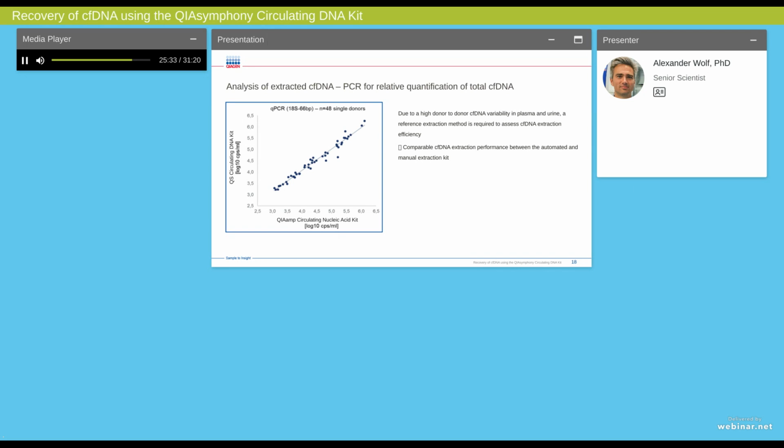In the last years, several providers of internal controls for cell-free DNA offer solutions to control the complete workflow, starting from the DNA extraction process via the downstream assay until the final data analysis. Despite the clear advantage of running an independent control for each sample, in particular due to the known challenges of the very low and variable cfDNA concentrations, it should be considered that these internal controls should be used qualitatively rather than quantitatively. That means they can give you a clear yes or no answer regarding the success of the workflow.